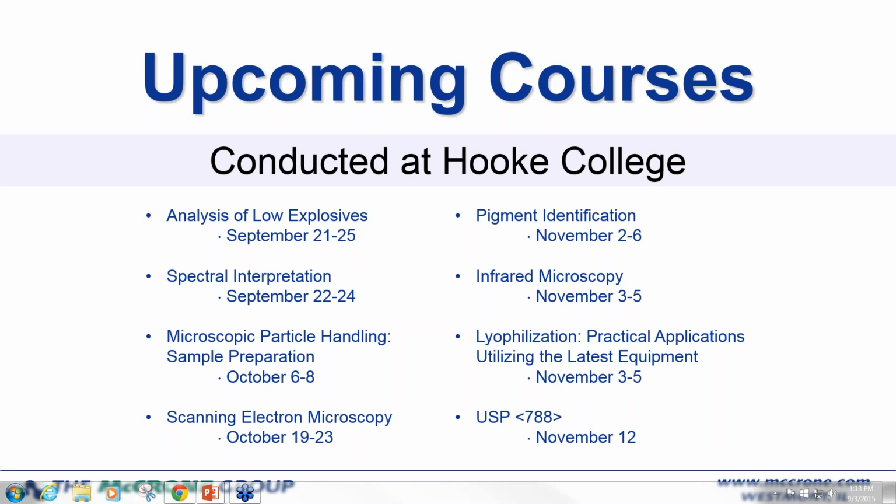Since this particle consisted of two phases, the coating and the core rubber, we'd still need to make sure that we had good separation. We'd either have to separate them and then run ATR, or make sure that when we pressed it out on ATR we had good clarity between those. So it was just as straightforward for me to do it in transmission. Either technique would be applicable.